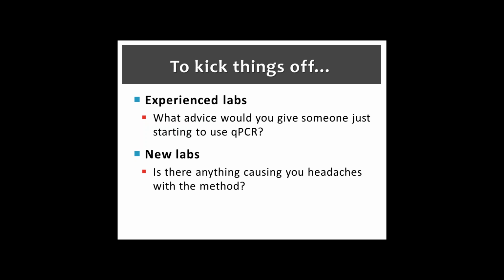So those are the numbers that people are talking about. Is it 235? Is it 126? I don't know. Well, it depends on how many samples you have. Sample events, exactly. Because you need at least 5 days of different samples coming in. And then you can start calculating that rolling geometric mean.